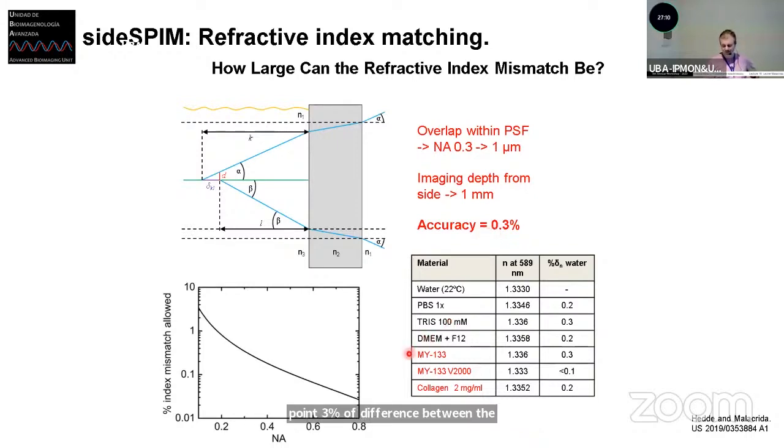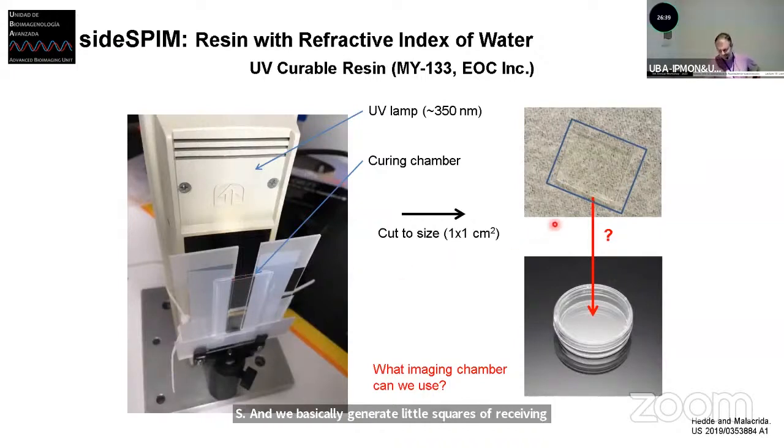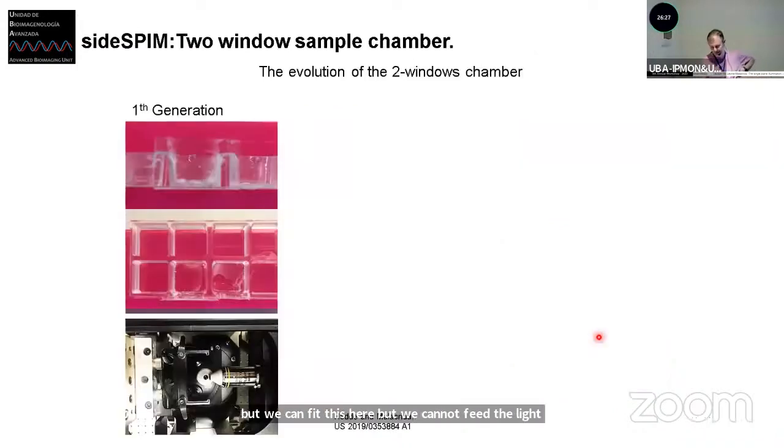We found two commercial resins, and then we discovered that collagen is very nice to use, because most cells in real life live inside collagen, so we use it a lot. For the resin, we have to cure it using a UV lamp, and we generate little squares of resin one millimeter high. It's very difficult to see here, but there is one of these resins. The next challenge was, okay, we can fit this here, but we cannot fit the light sheet, so we need to develop a new chamber.